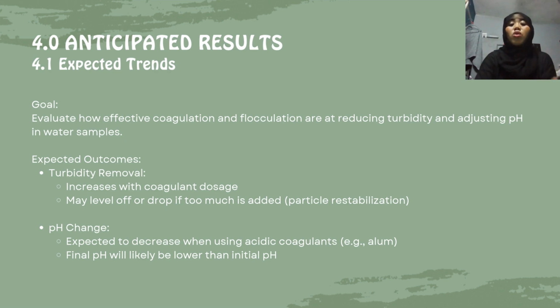However, if too much coagulant is added, we may observe a drop in effectiveness. This is due to a phenomenon known as particle restabilization, where excess coagulant causes the particles to repel each other and remain suspended instead of settling.